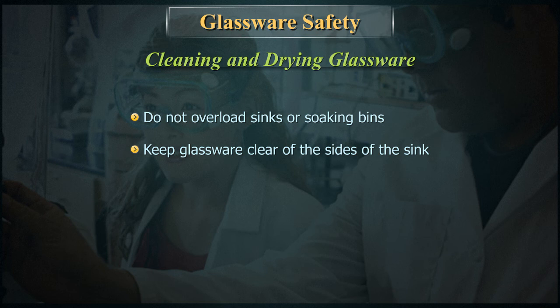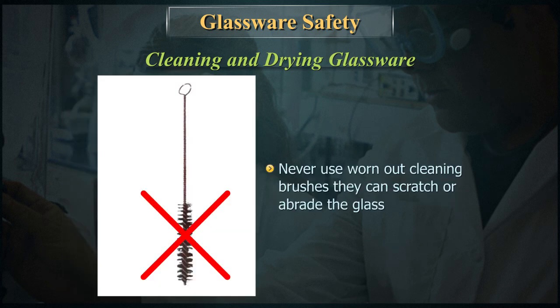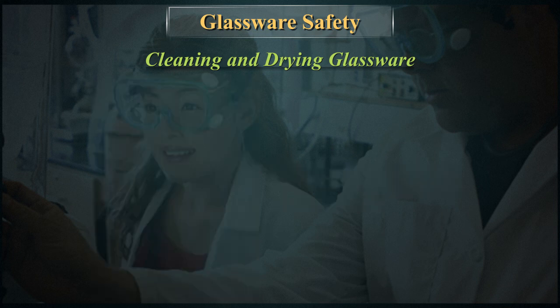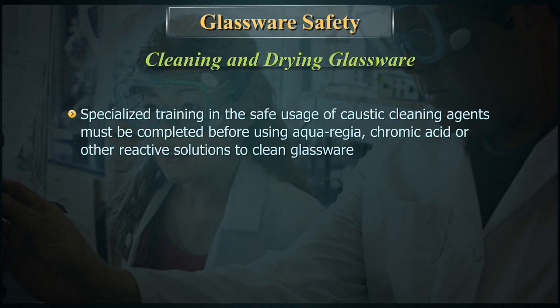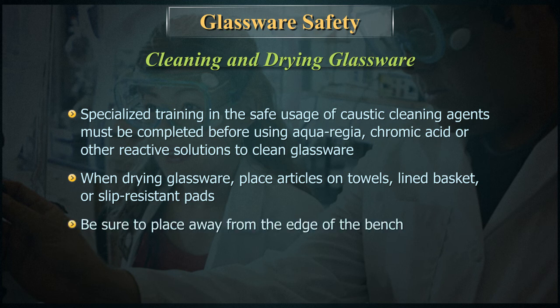Keep glassware clear of the sides of the sink. Rubber mats can also help reduce the risk of breakage and injury. Never use worn-out cleaning brushes — they can scratch or abrade the glass. Specialized training in the safe usage of caustic cleaning agents must be completed before using aqua regia, chromic acid, or other reactive solutions to clean glassware. When drying glassware, place articles on towels, a lined basket, or a slip-resistant pad, and be sure to place them away from the edge of the bench.